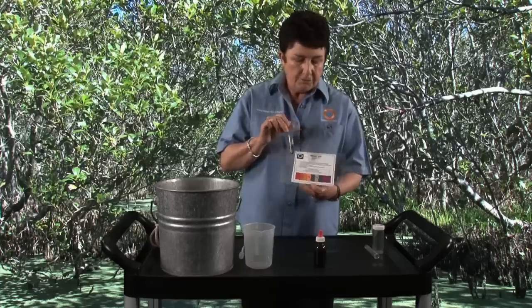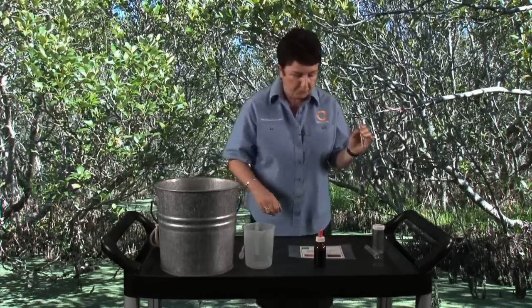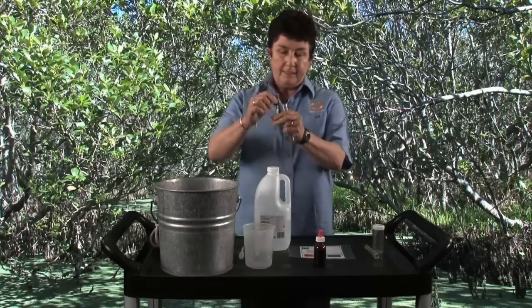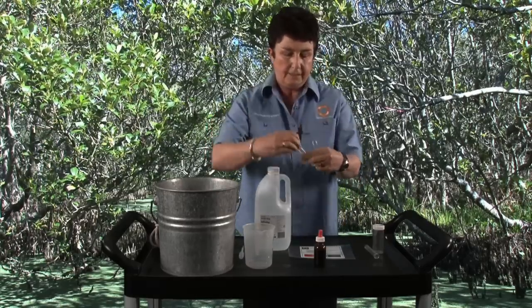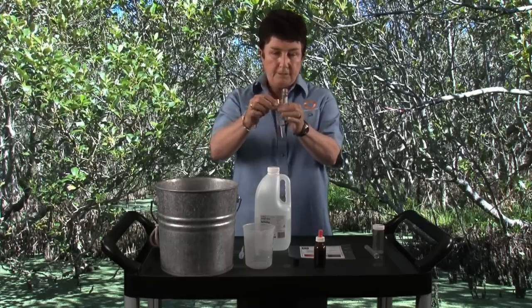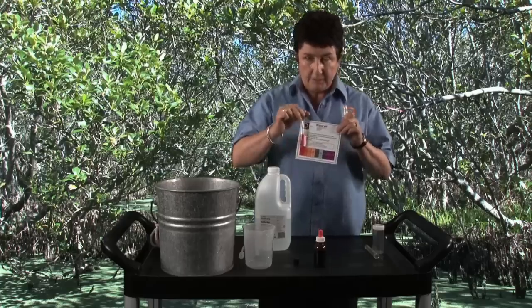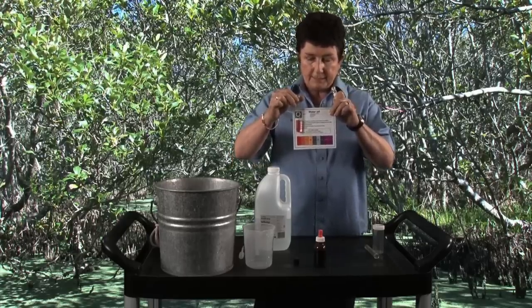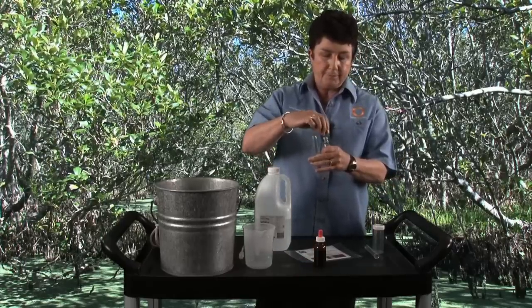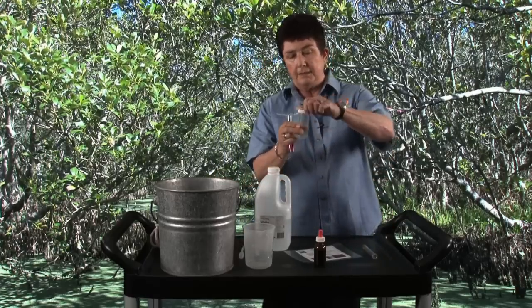Just to show you that all results of water will not necessarily be of neutral pH, I have a solution of vinegar here in this test tube. And if I add vinegar to this water sample, you'll notice that the indicator straight away turns red, showing that the water is now of acid pH. When we're finished doing our field sample of pH testing, of course, we dispose of it in a waste container.